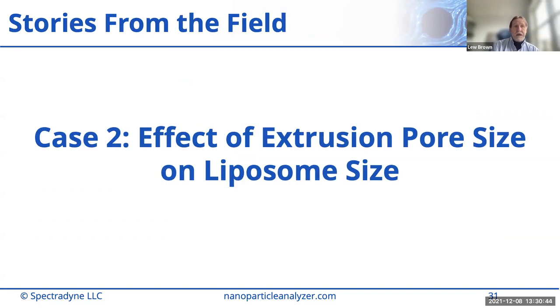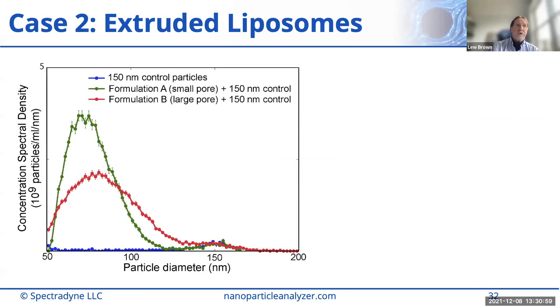Case 2 here is the effect of extrusion pore size on liposome size. So it's a little bit different. As probably some of you know, liposomes are typically made through an extrusion process, and they use a pore to extrude it through.